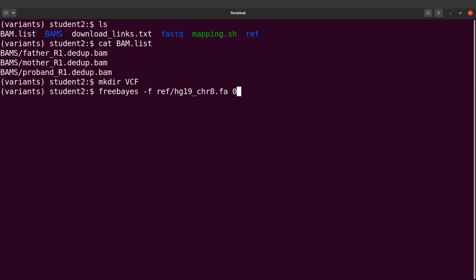So I'll say -L bam.list, and then I'll say --vcf vcf/variants.raw.vcf. Perfect. So this becomes our final command. So let's execute this command.